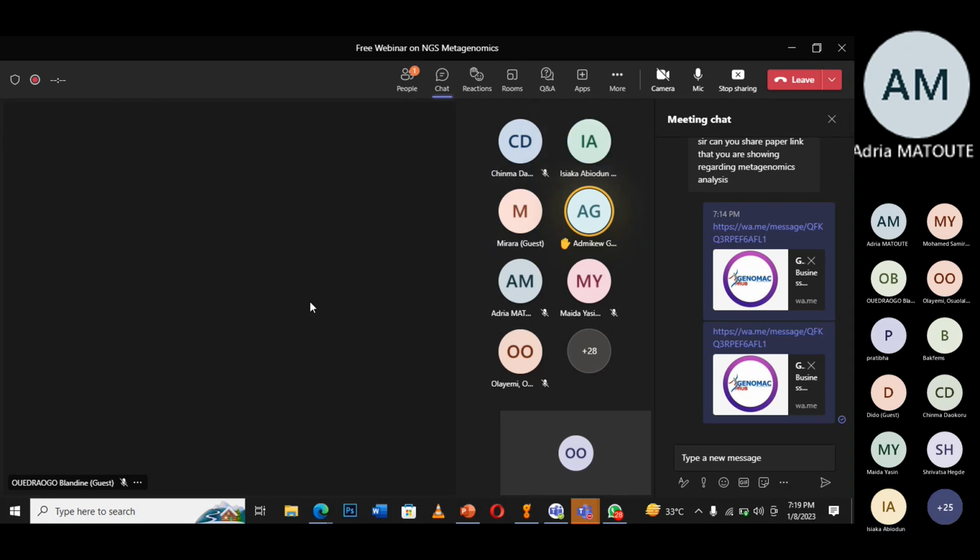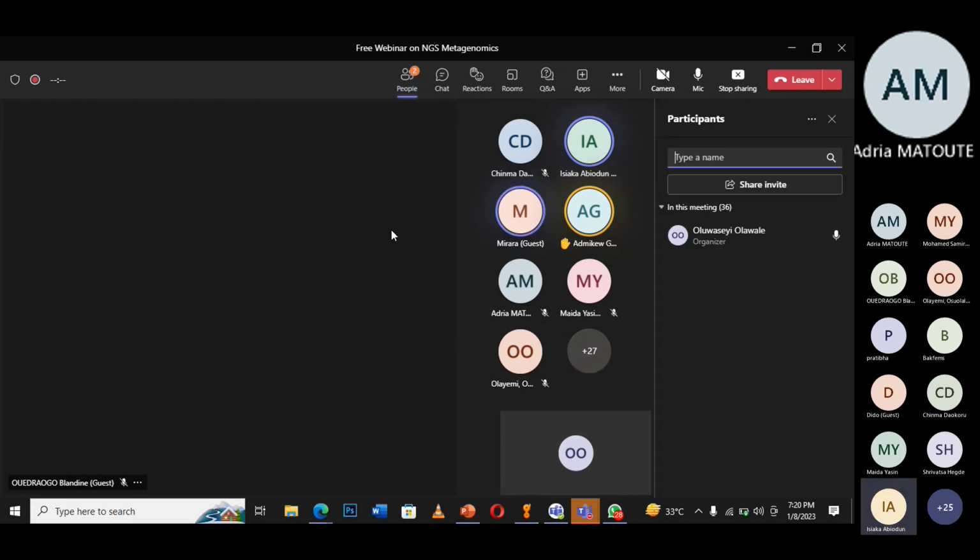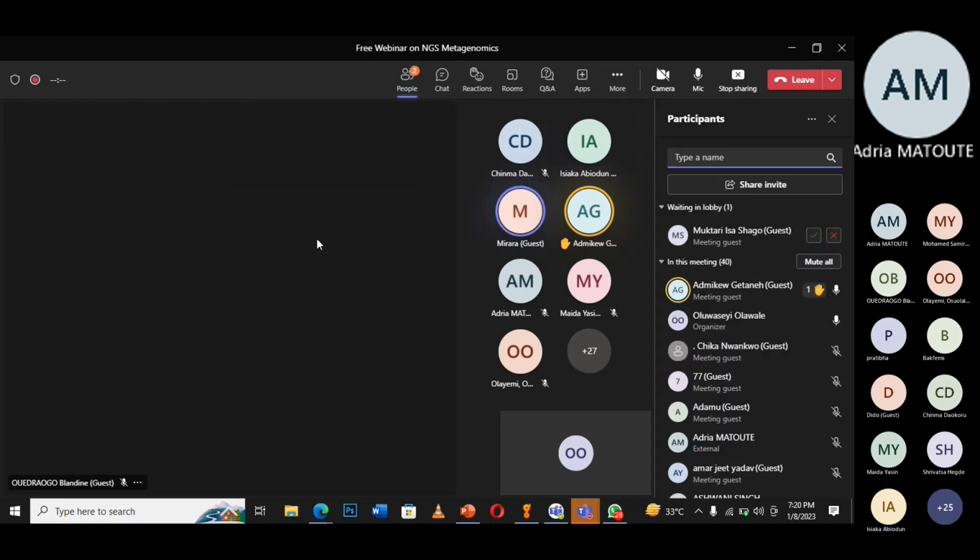Oh, well, I'm in Nigeria, but I believe you should be able to search and ask around where they do ITS sequencing in Ghana. It's not something much. Some molecular labs should be able to do it. Because it's very difficult to operate whole genome sequencing in a developing country, but not ITS. Okay, thank you. You're welcome.